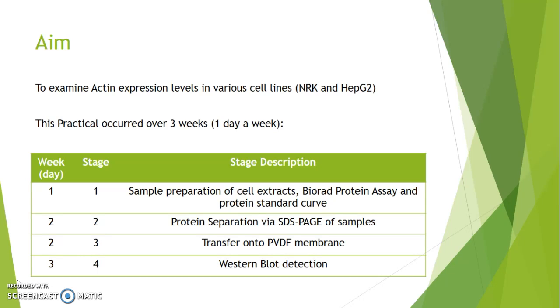In the second week, the second stage occurred. This was protein separation via SDS-PAGE of samples. Also, the third stage occurred in the second week, which was the transfer onto PVDF membranes. In week 3, the fourth stage of this process was the Western blot detection.